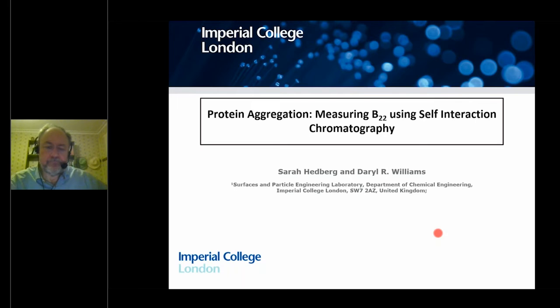In connection to the question of layered materials, the participant is asking, what is the mesh size used? Let me turn the question around slightly. We have a range of different columns that go in the instrument, and they have IDs of 2 millimeter, 3 millimeter, 4 millimeter, and I think 10 millimeter. So the sample has to fit inside those dimensions to go inside one of the round glass columns. 2, 3, 4, and 10 millimeter are IDs.